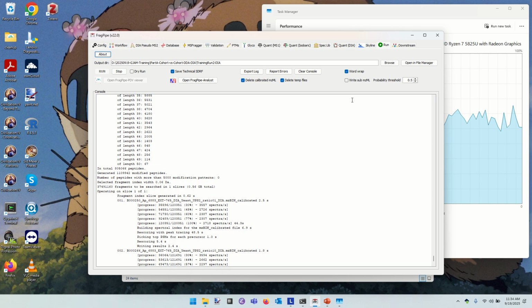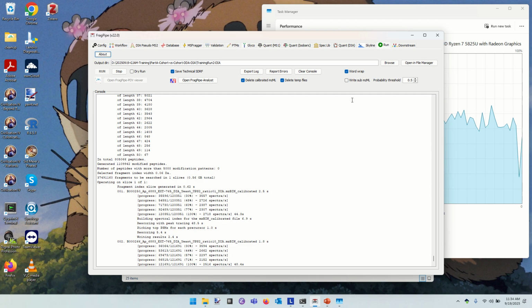So let's imagine that we have two peptides, and these peptides overlap in chromatographic time, but they are not identical. It's not like when one peptide shows up, the other does, and then they go away at the same time. Let's imagine that one shows up 15 seconds after the other.